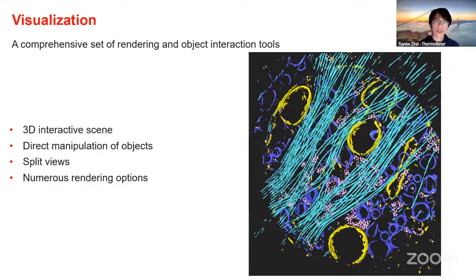A lot of times I have seen with cryo-EM images that it's a rather thin section. When the data set is received, it's probably a cube-looking 2D stack, but the actual meaningful data is only contained in that small central section.